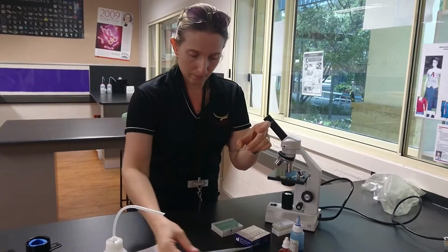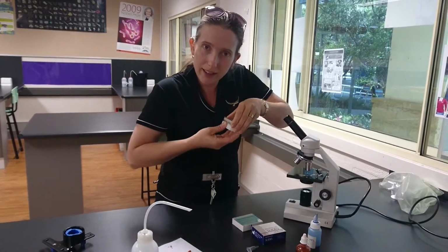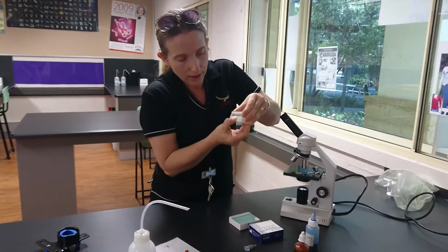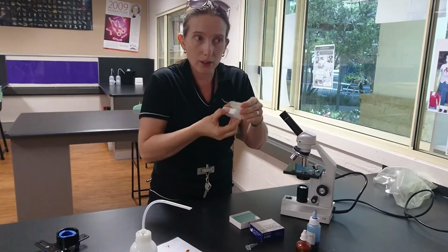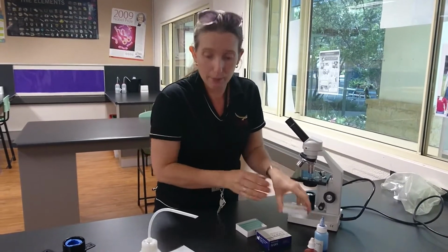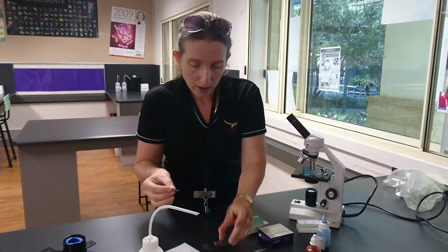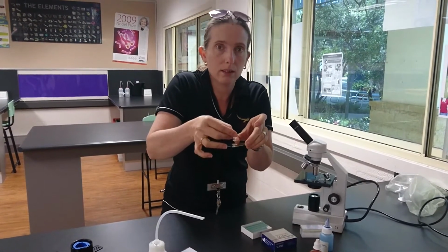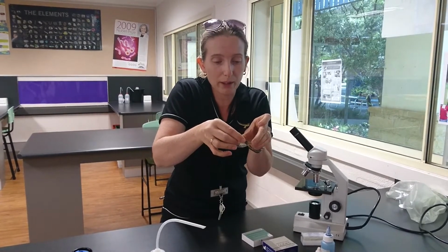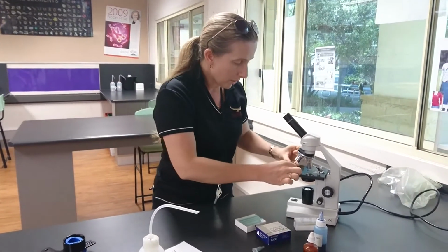Now when you get out a cover slip, be really careful because they stick hard, these boxes. Press in the white bit and gently pull that up so that you don't pull it up too fast and throw the cover slips everywhere. I've seen that happen before. Be very careful, they are fine. Try and put them down with as little oxygen or air as possible. I'm sorry for the background noise. There's your cover slip, and put it on your microscope.